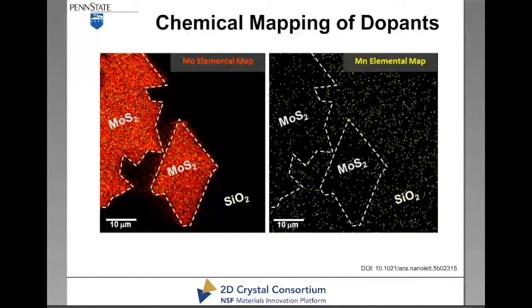Doing the 60 by 100 nanometer scan that's shown in D here, you can see there's a Moiré pattern. That Moiré pattern tells us a lot about the orientation between the layers. Based on stacking the theoretical layers on top of each other and then rotating them, which is in E on the bottom here, you can match pretty closely the distance of that Moiré pattern. In fact, it turns out that it's about a 2-degree mismatch between MoS2 and WSe2. You can then take that same sample and do scanning tunneling spectroscopy on it.